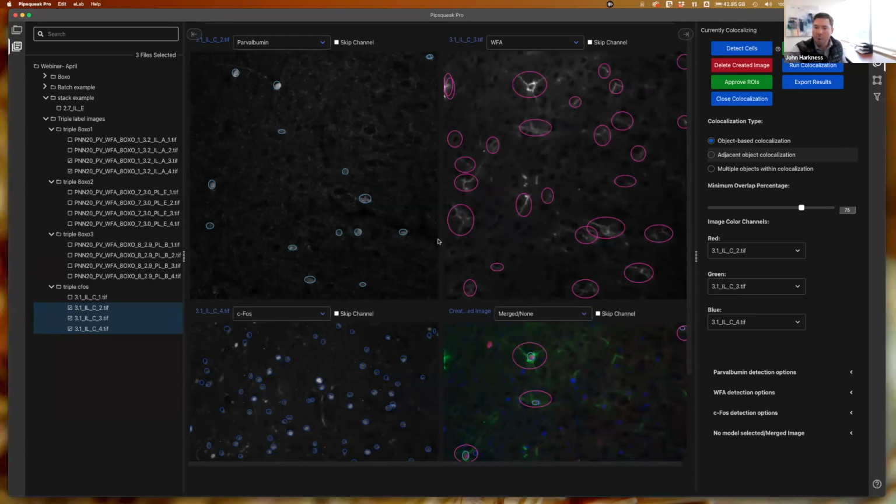So what we're reporting back to you is that arbitrary unit as just a pure number, but we're also providing a mean minus background column that is a normalization that we would always report in some of my work. I think either using that or an integrated density metric are two good ways to get around some of the variations in intensity or variations in staining across your experiment.